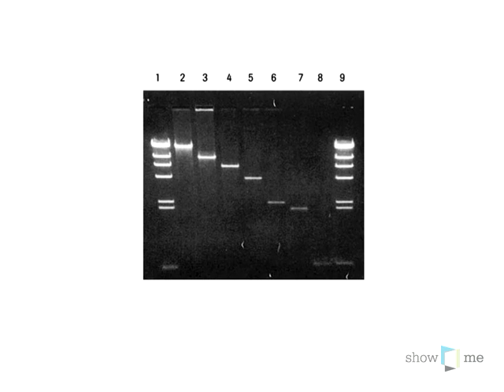Okay, so in order to determine the size of a DNA fragment on a gel, the first thing you have to do is to actually measure from a starting point, which, if you look at lane 9 over here, to the edge of the gel. You could just use the edge of this picture if you wanted to. You can kind of see the wells. I'll circle one right over here in orange. You can actually see a well right there. So you really need a common starting point. I'm just going to use, in lane 9, this edge there.